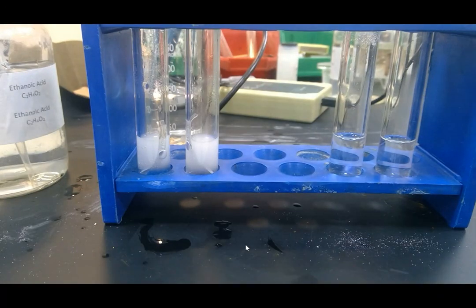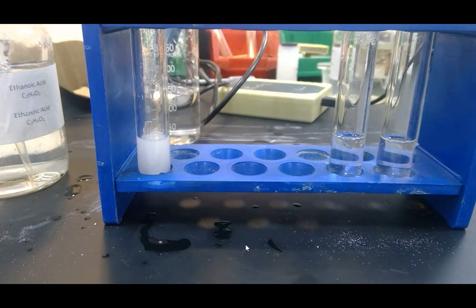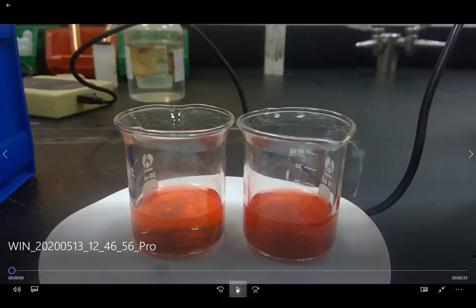Okay, the reaction with the magnesium is still going. I'll come back to that one. Restart the video when one of them disappears.